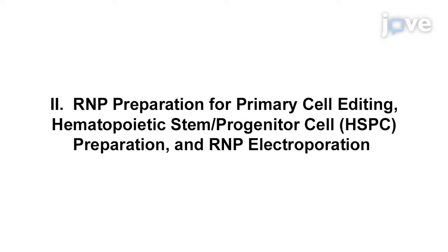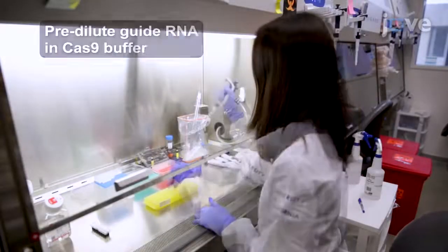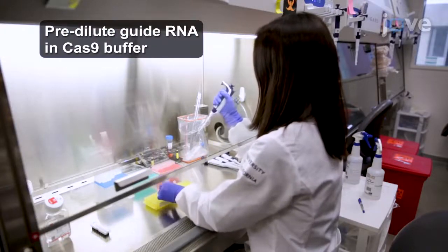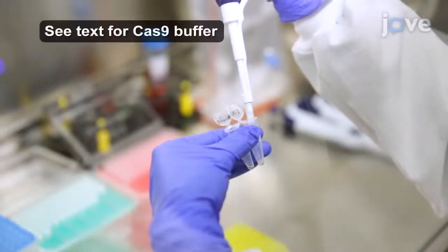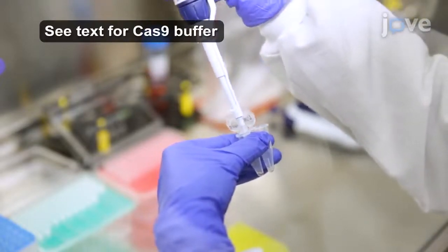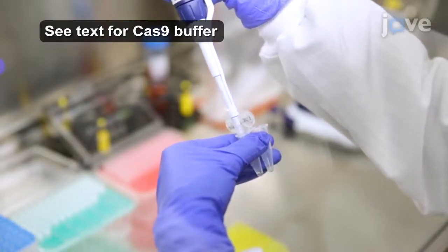Begin this procedure with design and preparation of guide RNA as described in the TEX protocol. Assemble an RNP complex by mixing a 1 to 2 times molar amount of guide RNA with 200 picomoles of Cas9 protein in a total volume of 10 microliters. Very slowly, add concentrated Cas9 to the guide RNA for about 30 seconds, making quick circles with the pipette, bringing the final Cas9 concentration to 20 micromolar.